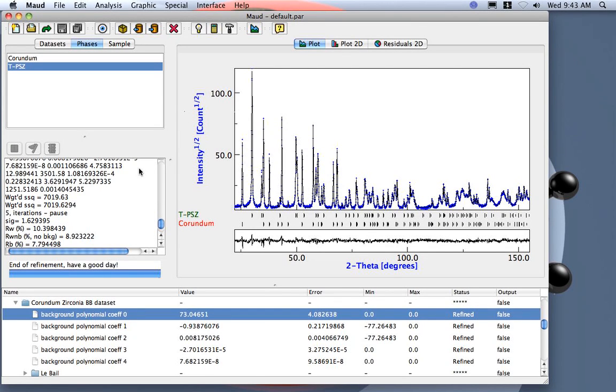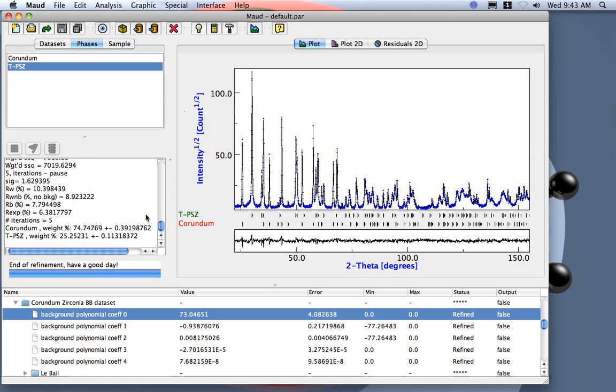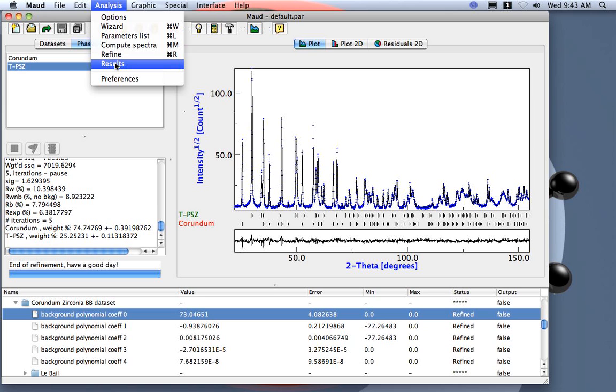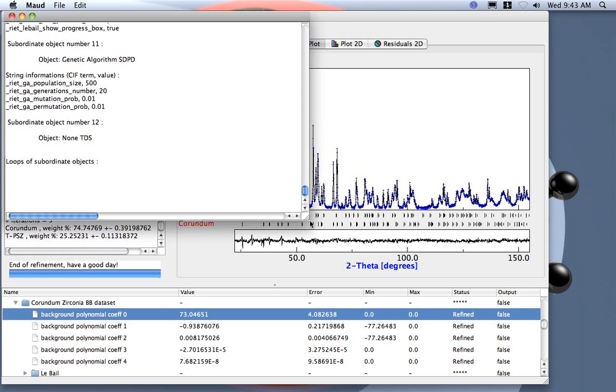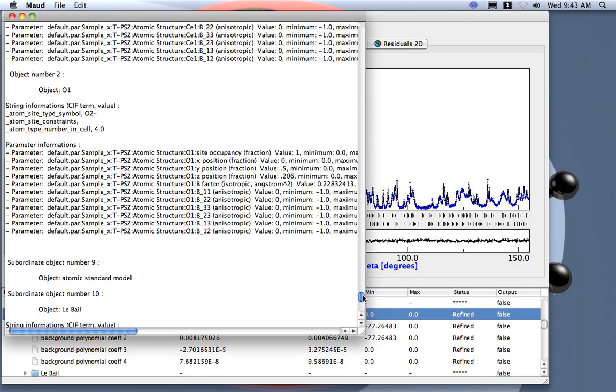Now we have finished, so we can check the result and see if we can improve our fitting. If you want to see the result, you can go to the result window here. It's just a text file.